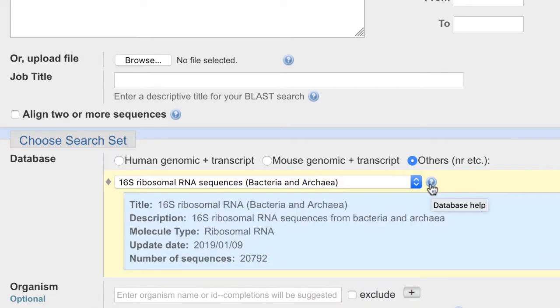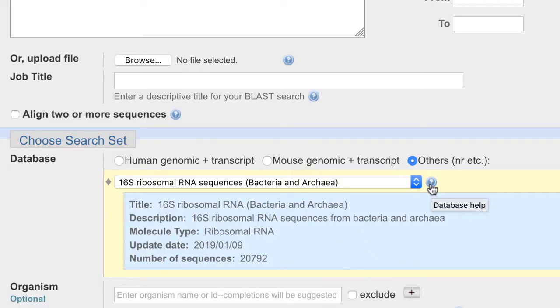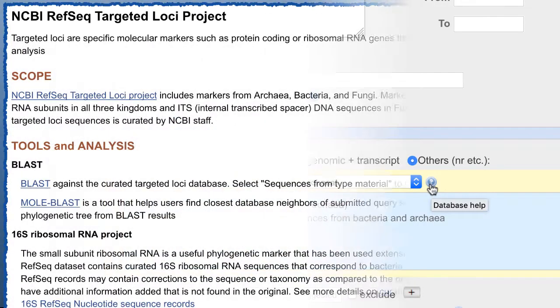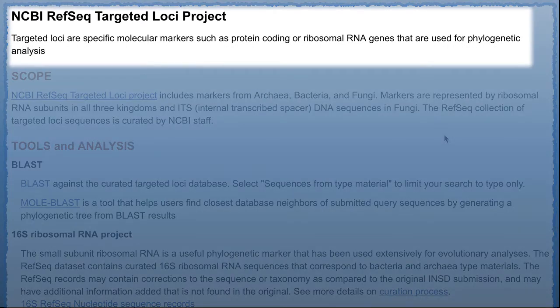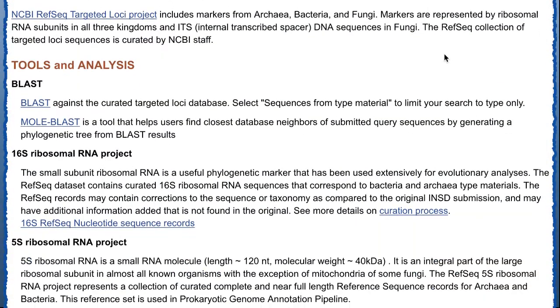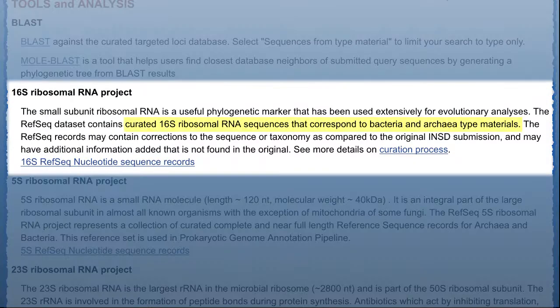You can see in the table for this database that today it has almost 21,000 entries. Be aware that this is a curated set of sequences, so it does not include all 16S records found in NT, its parent database. In fact, this database is part of our RefSeq Targeted Loci project, and it contains only records representing type material, thereby providing a source of trusted data that is linked to peer-reviewed publication of the source organism.